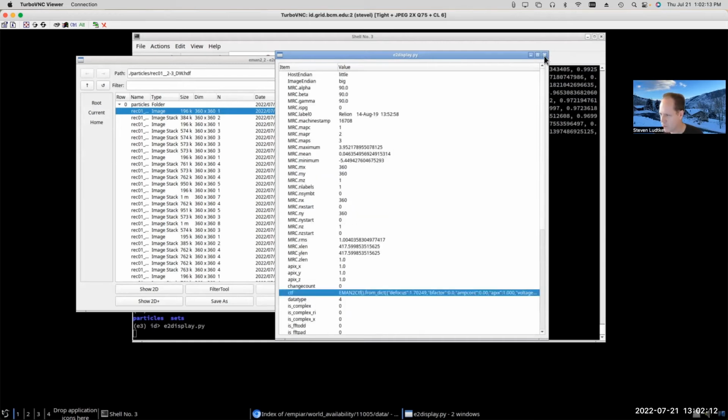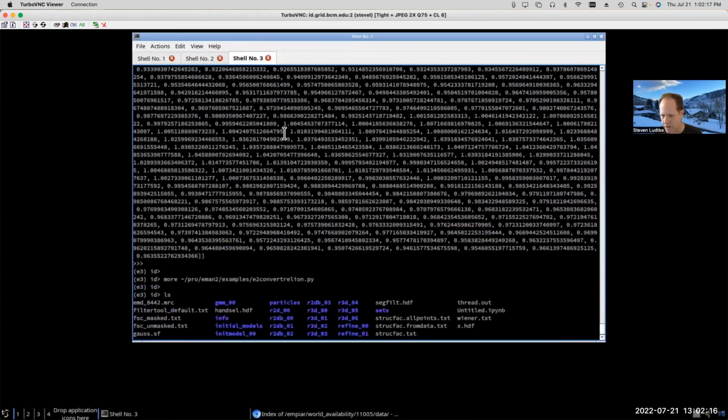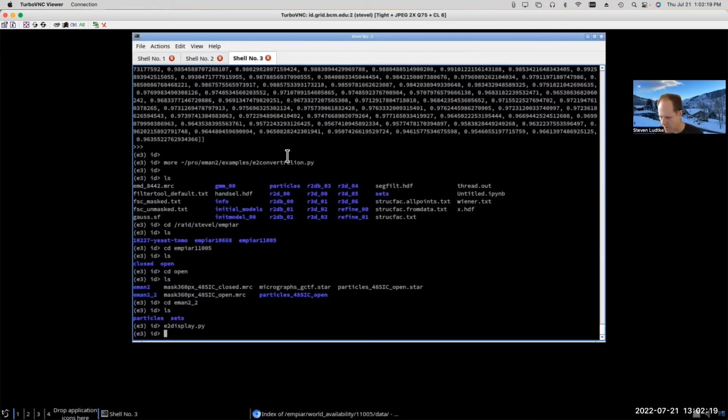So really the only parameter information that was stored in the LST file was the orientation information, which is something that would change if we ran further refinements on the data. But we're going to assume that the defocus parameters and stuff like that aren't normally going to change. Now, if you did a refinement using the new 3D refinement program, it would produce a new LST file for each iteration. And those LST files might also include defocus information, because there is an option to refine defocus while you're running.